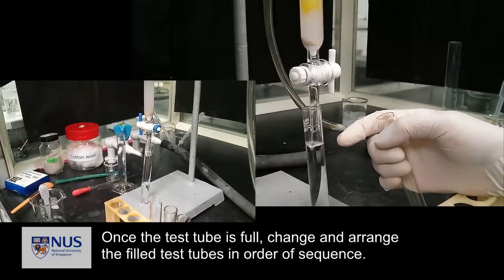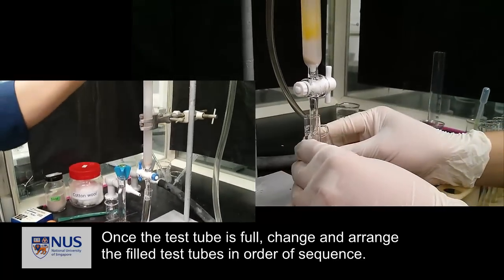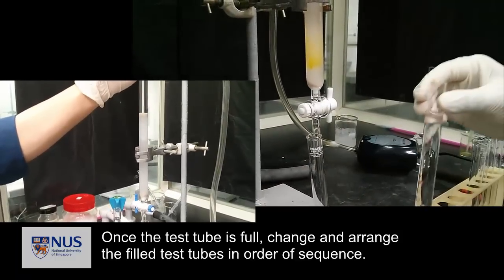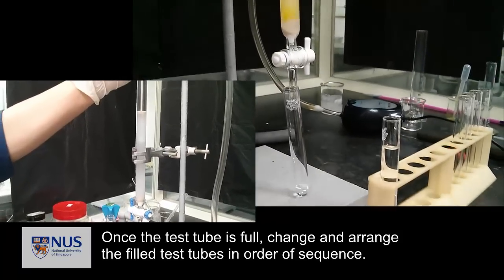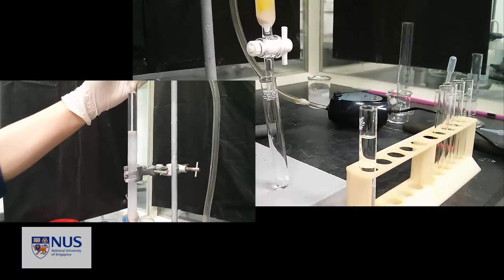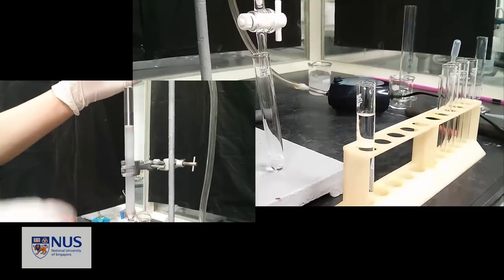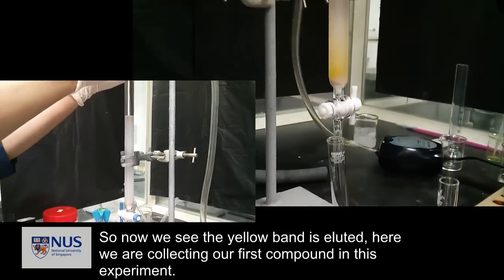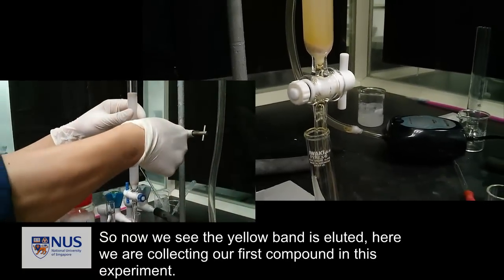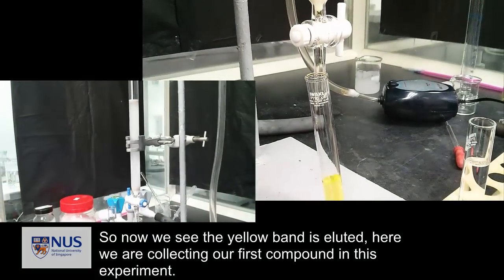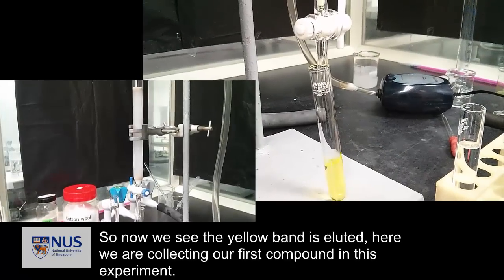Once the test tube is full, change and arrange the few test tubes in order of sequence. You can see the yellow band is eluted. Here we are collecting our first compound in this experiment.